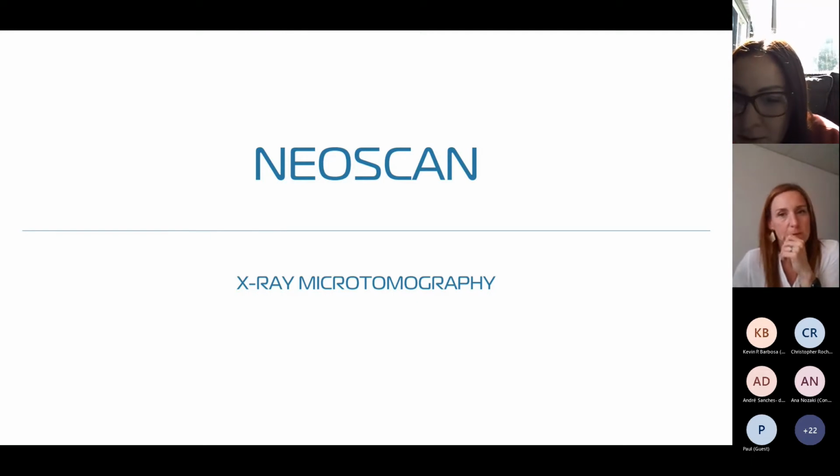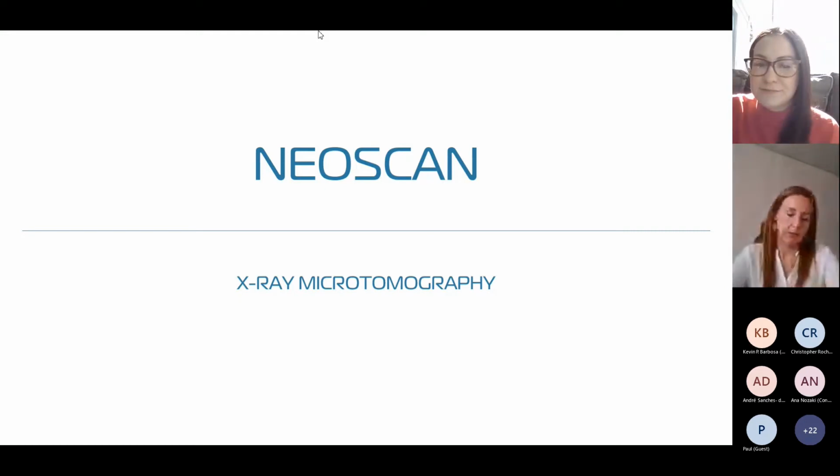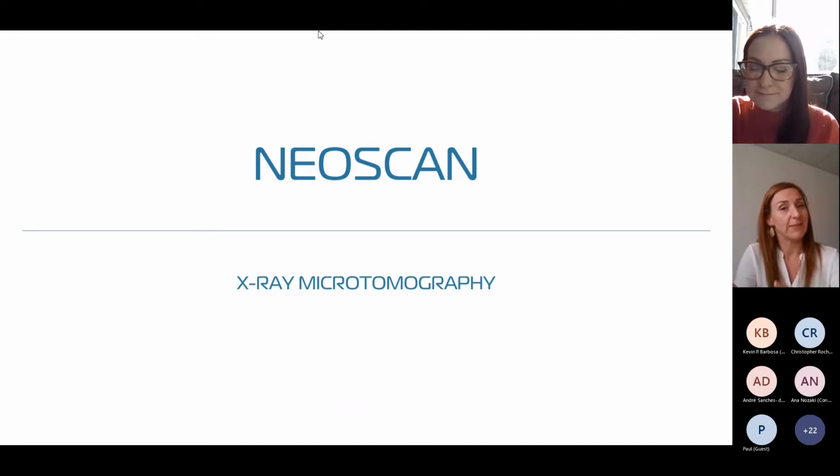Christopher asks: in the software, are there some functions for gray shades, density and grain size measurement, for geological applications, as in the Mineralogic 3D from Zeiss? Yes, the 3D mineralogy analysis is about the analysis of the data.